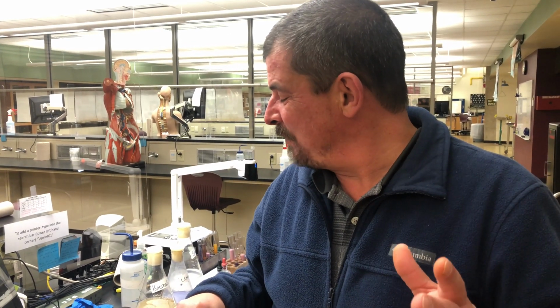Then we'd put these test tubes in an incubator for approximately an hour and a half. If you read number 4 on your checklist, it says at 37 degrees Celsius. Well, 37 degrees Celsius is actually 98.6 degrees Fahrenheit, which emulates body temperature.